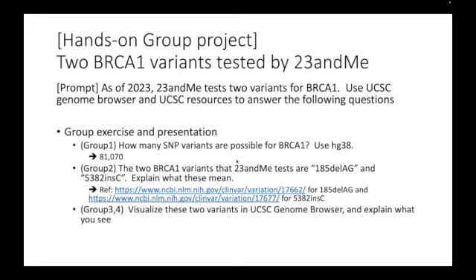And if you happen to sequence it, you will be surprised that you are sequencing more of your microbiome rather than yourself. A lot of the sequencing data actually goes there. You're basically wasting a lot of the sequencing information there, and it can also potentially cause some error. Even though microbiome sequence is pretty different from the human, there is still a possibility of a potential error.